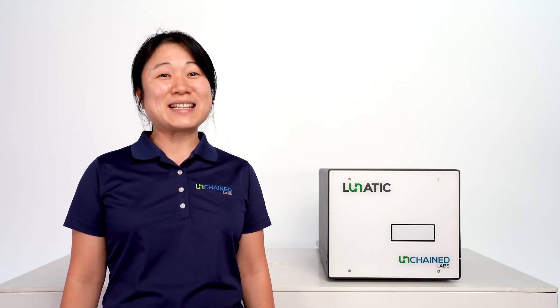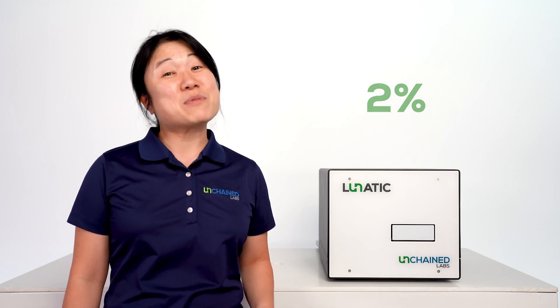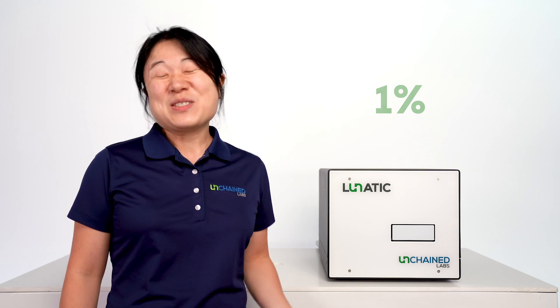You'll see how you can use the Fundamentals Kit to show off how accurate and precise the Big Lunatic is, with accuracy within 2% and precision within 1%. So cool, right?